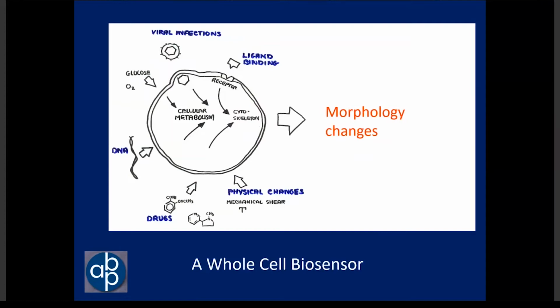So anything that affects cell morphology is something that usually will be reflected in the ECIS measurement, from looking at cytopathic effects of viral infections, signal transduction, changing respiration, adding different drugs, of course, changes in the physical conditions, and so on. It's a very useful morphological monitoring system.